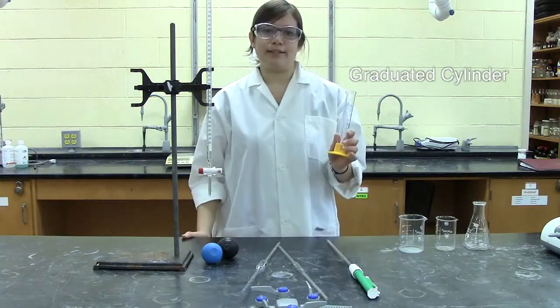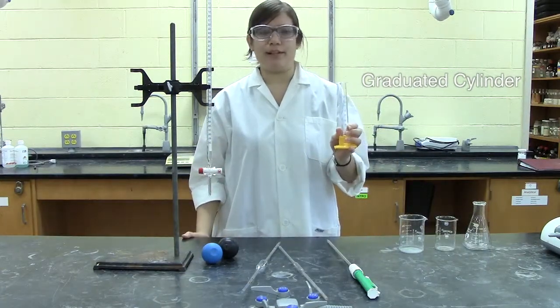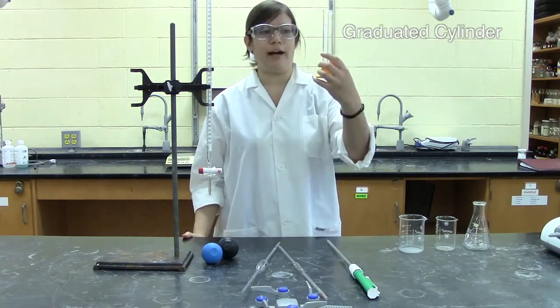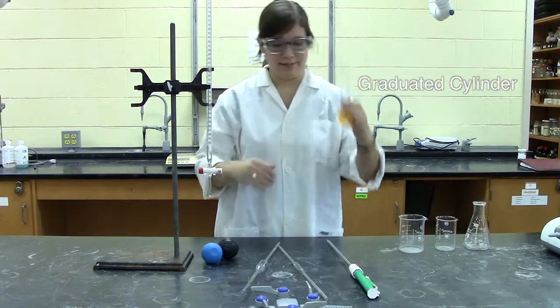Next we have the graduated cylinder which is good when you need a more precise measurement. It's accurate up to 0.1 milliliters. Just be sure when you're reading it that you have it at eye level and are reading from the bottom of the meniscus.